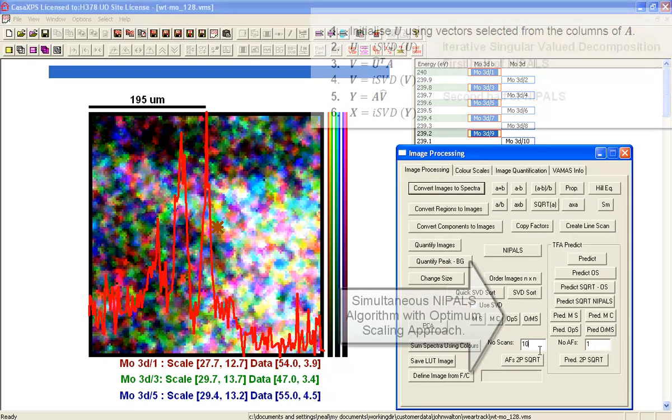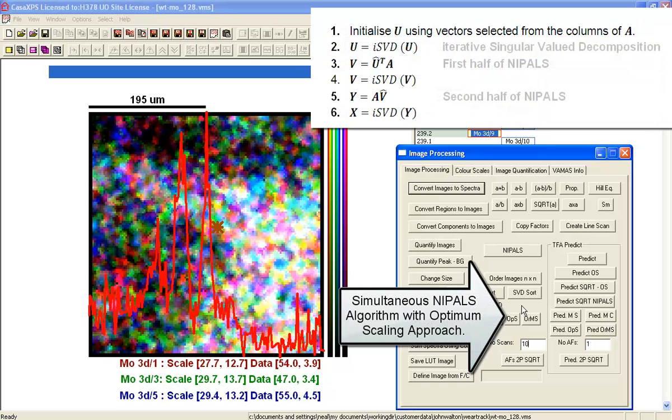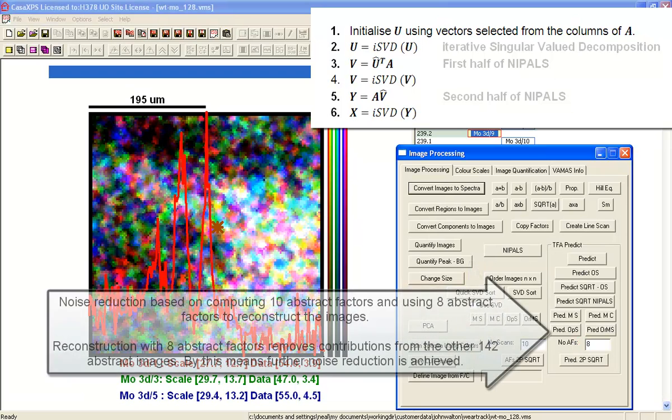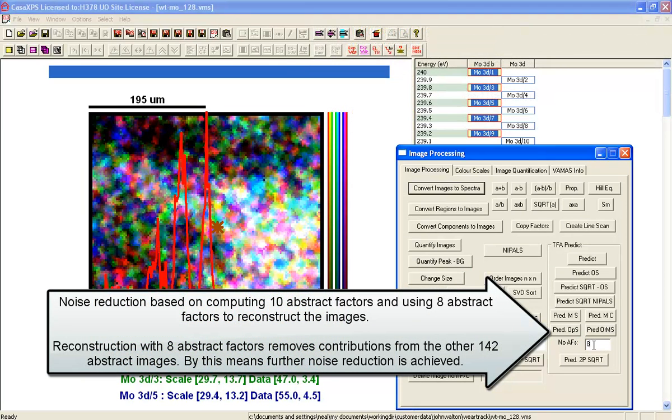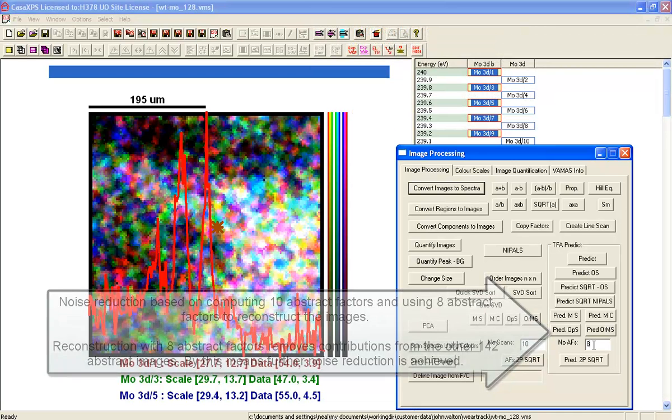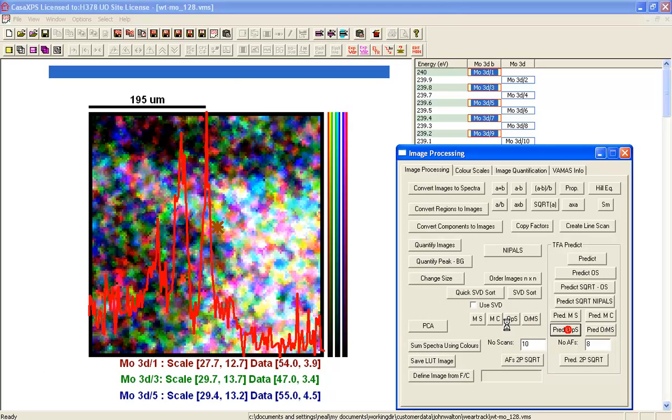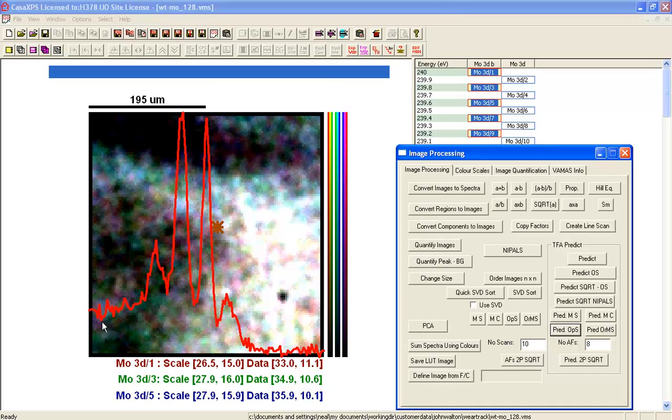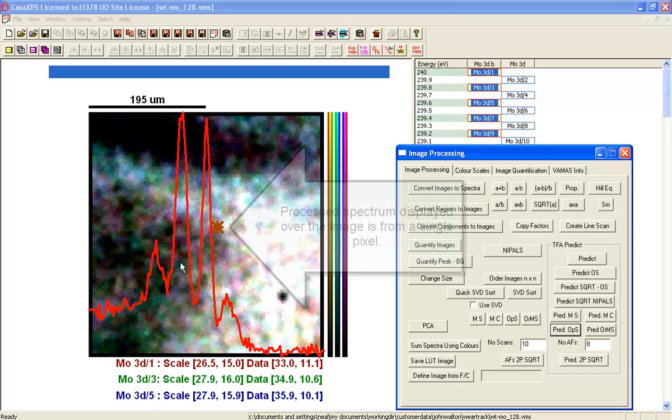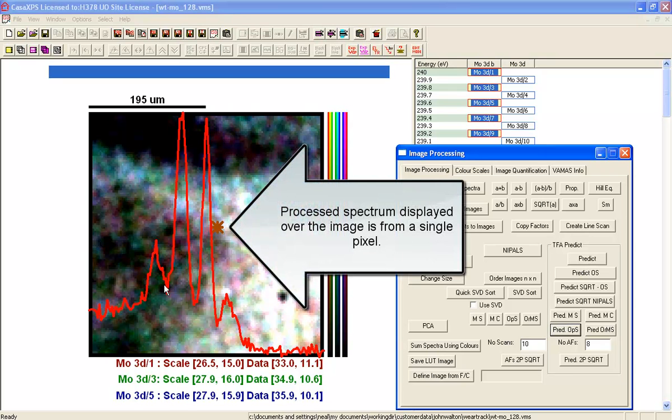Now let's go to the options on the image processing page. I'm going to select to calculate 10 abstract factors and I'm going to use eight of them to reconstruct the data. I'm working on the basis that there will be more than or less than eight abstract factors that are significant to the data. So I'll press this button here. When I recreate this data set using eight, then I will include some noise in the spectra. As you can see, there's an element of noise here. But clearly now at a pixel, we have a spectrum, which is quite obviously the molybdenum disulfide with some molybdenum oxide mixed in there as well.